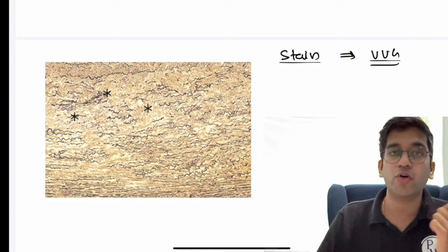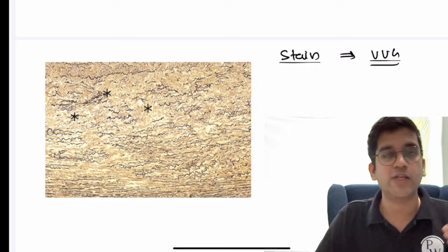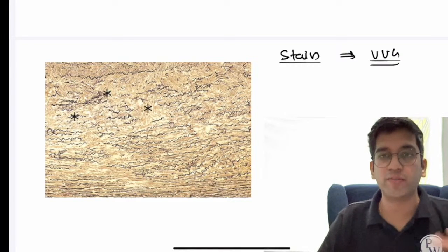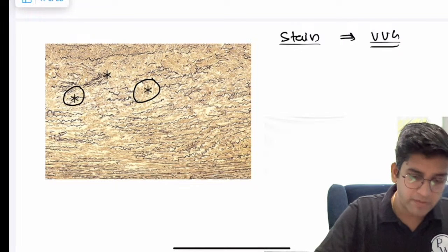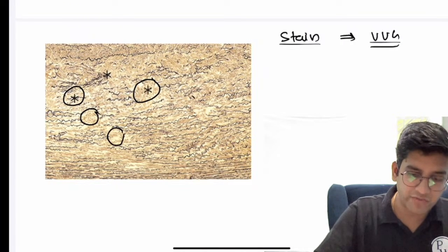Reticulin is not used for blood vessel. It is useful for all your reticuloendothelial system, like your liver, like your spleen. I use them, I don't use them for blood vessel. It's an elastic tissue stain, right? So here in this elastic tissue stain, I'm having areas of destruction of the blood vessel.